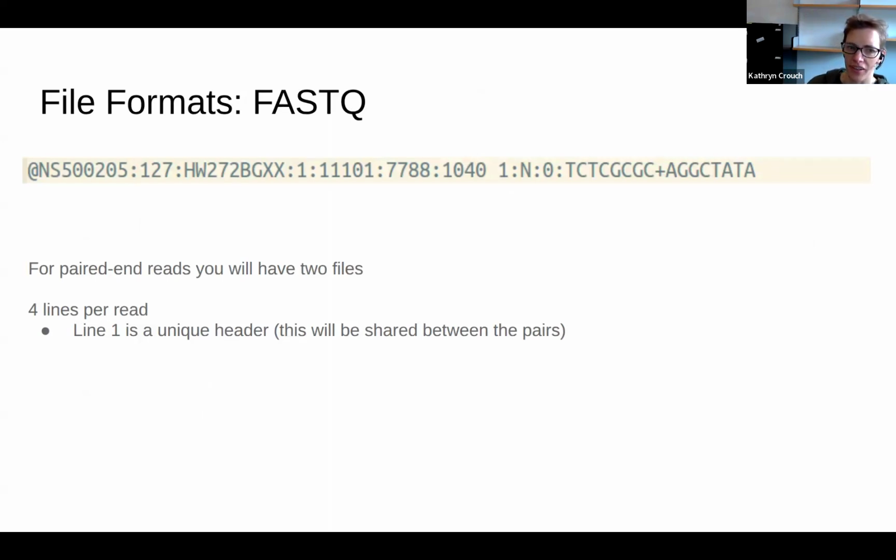After you've done your Illumina sequencing, you end up with files called FASTQ files. If your sequencing is single end, you end up with 1 FASTQ file. If it's paired end, you end up with 2 FASTQ files. And each file contains all of the reads you've sequenced. For an RNA-Seq Illumina dataset, it would be typical to have tens of millions of reads, depending on the size of your organism's genome. And each read is encoded as a block of 4 lines in the file.